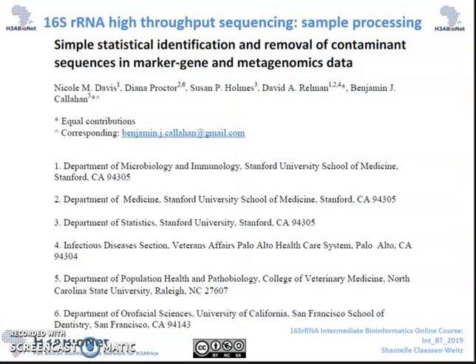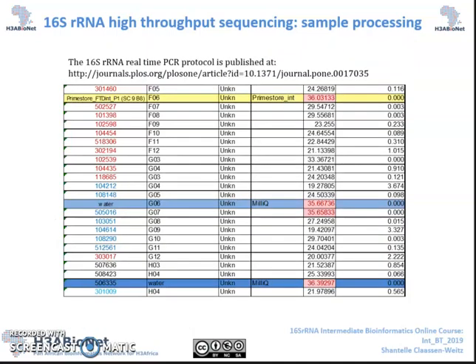It is therefore critical that you are aware of these potential issues when conducting an experiment and that you explore different routes to, firstly, identify potential contaminants, secondly, remove potential contaminants, and thirdly, if none of these seem to work optimally, even consider excluding some specimens from analyses, despite obtaining a good quality score during bioinformatics processing.